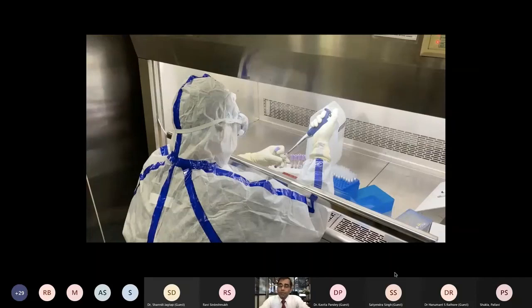If you want to do a project of 100 samples, the plasma samples you can easily obtain, but doing the depletion becomes one of the bottlenecks. But if you can afford to do that for a large number of samples, I think that's a good way to do your proteomics. Now, in case you are not able to do the depletion, in what other way can you move forward in your project?